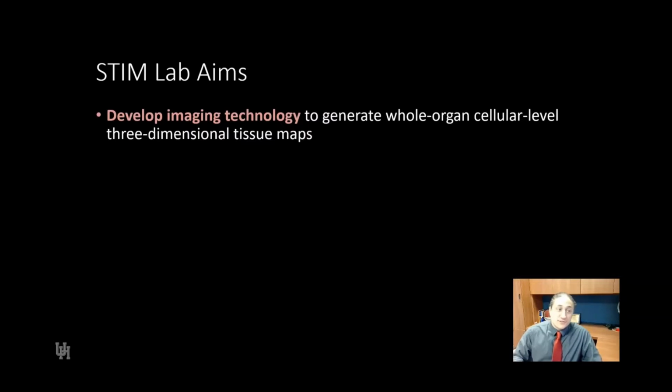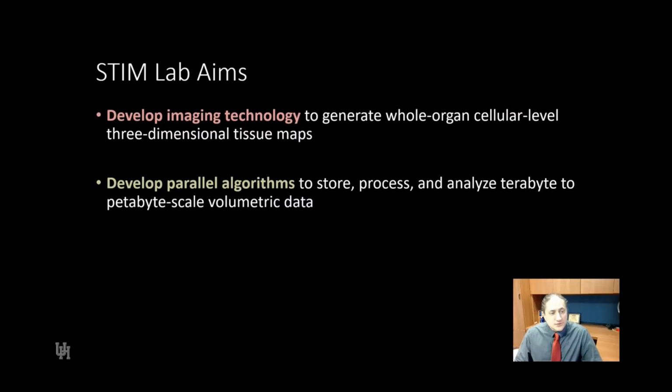This includes the development of instrumentation, such as high throughput microscopes that can collect three-dimensional images of cubic centimeters of tissue at submicron resolution. This is cellular level resolution. My personal background is in computer science, and we do a significant amount of high performance computing focused on analyzing massive amounts of image data using heterogeneous hardware like graphics processors.